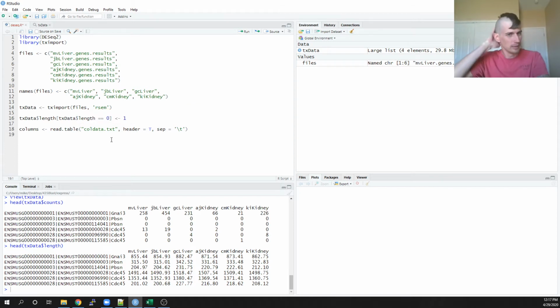So a typical table import. Okay, so the next thing that we have to do is actually build a data set, build this matrix in a way using DESeq tools that will define how we're going to compare these values. So traditionally, this variable is just called dds. Any tutorial that I've ever seen, we call this import variable dds.